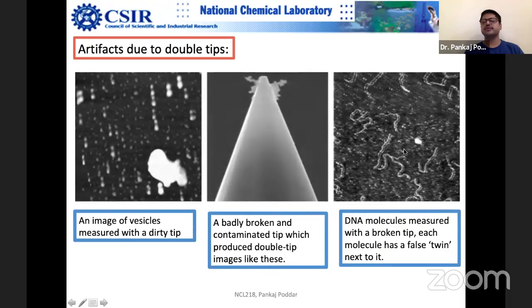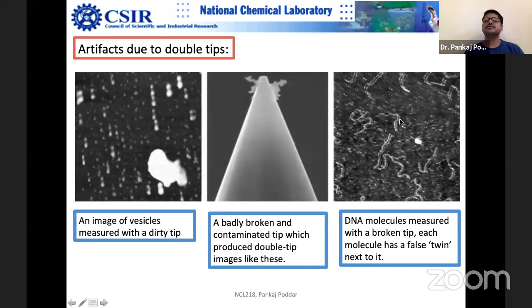DNA molecules imaged with a broken tip show false twin images close to each other. If you zoom in, you can see two DNA strands sitting side by side — this is definitely because of the broken tip effect creating double imaging.